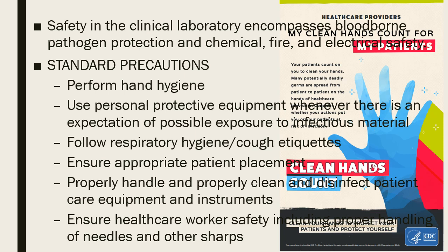Then you use personal protective equipment whenever there is an expectation of possible exposure to infectious material. Since you are working in the laboratory and handling infectious material, you are required to wear your personal protective equipment.